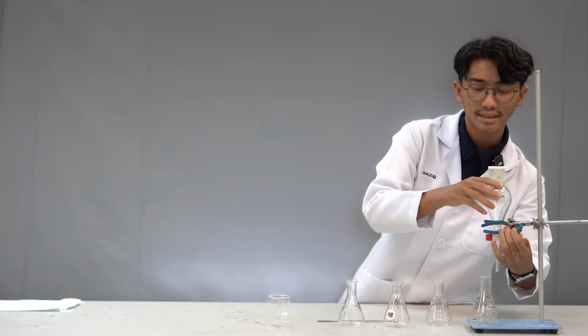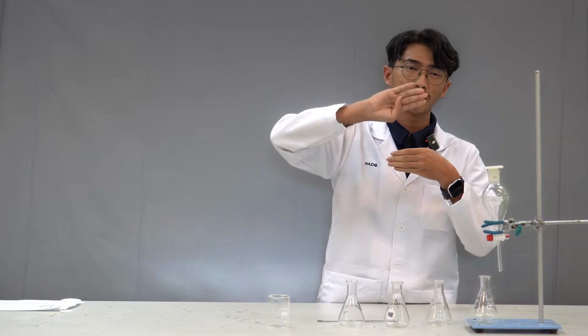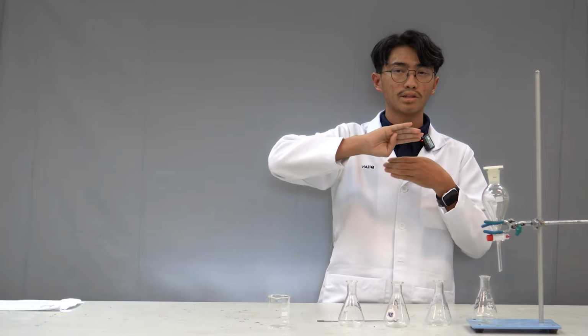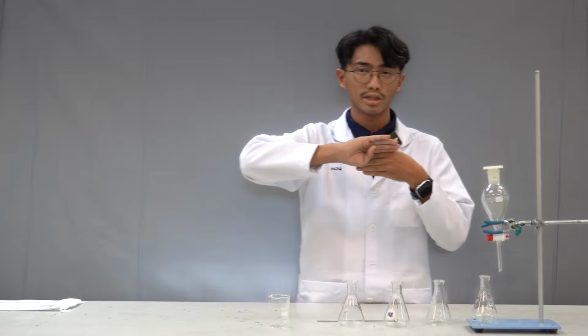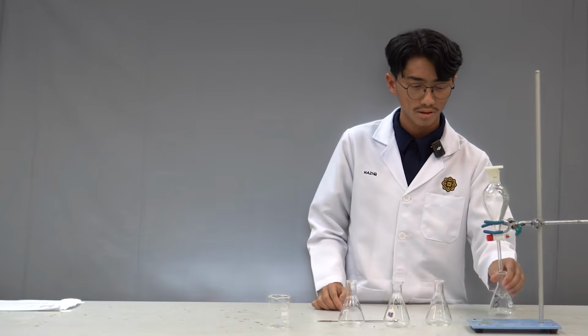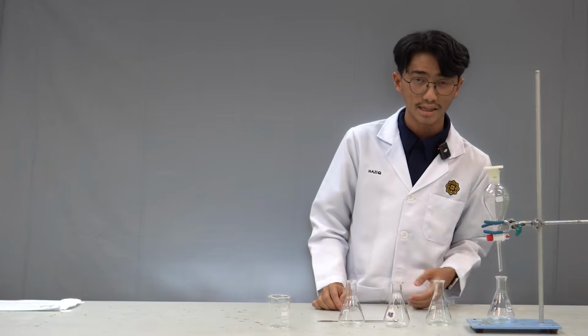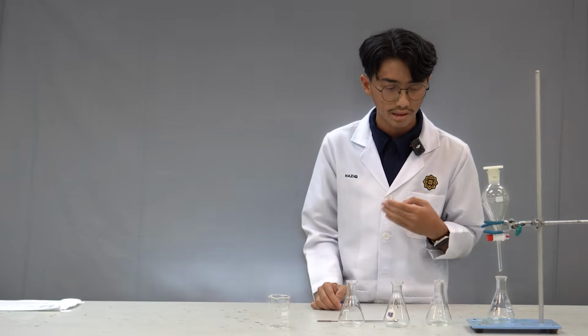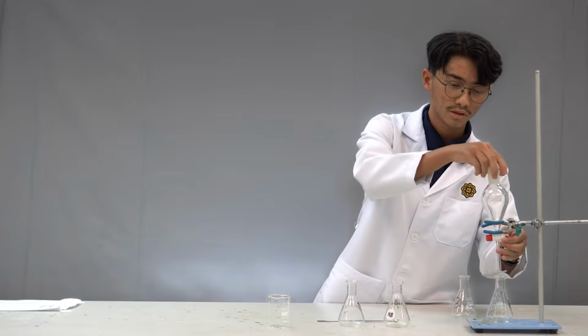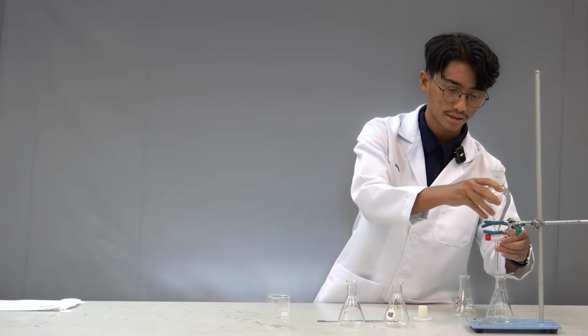And then in the separatory funnel, we can see there are two layers. At the top will be base, and the bottom will be a mixture of neutral and base, because the mixture of neutral and base is much denser than the base at the top. So we extract the first layer, the mixture of neutral and base, to the mixture flask. We open the lid first, and then we extract.